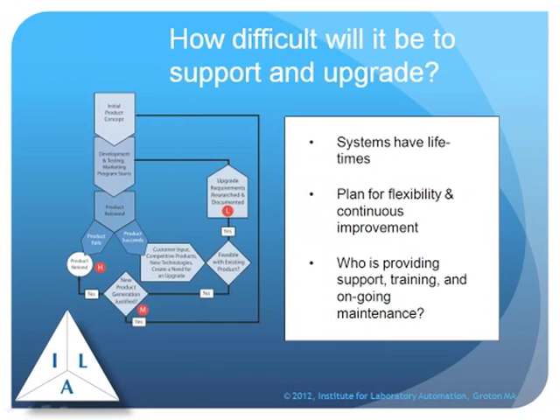And I'm not going to go into this now. We're going to be covering this in the next session. But this is a product lifecycle diagram. It's probably a lot different than you may have seen before because it looks not only at upgrades to products, but the creation of new generations of products, and considers what happens if a product is retired. All those things have impacts on your laboratory, and you've got to take them into account.